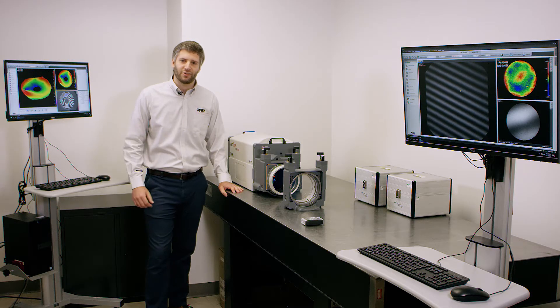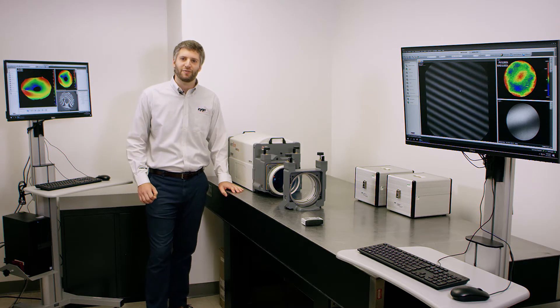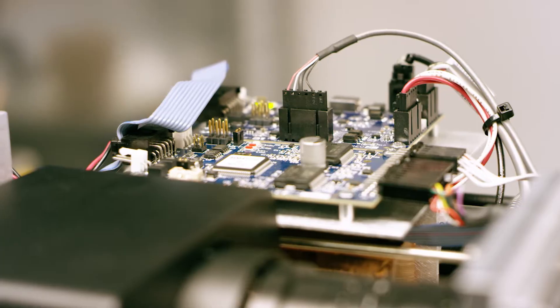Zygo has been manufacturing laser interferometers for nearly 50 years, but what exactly do these instruments do? Simply put, they measure the quality of optical components and systems. Let's go take a look and see how that happens.